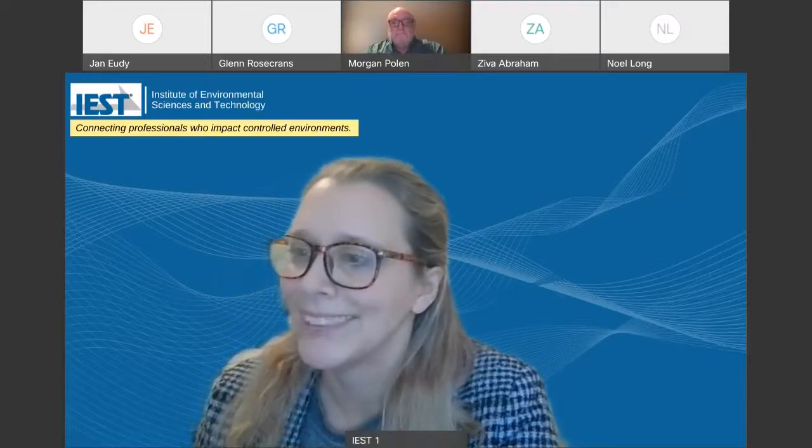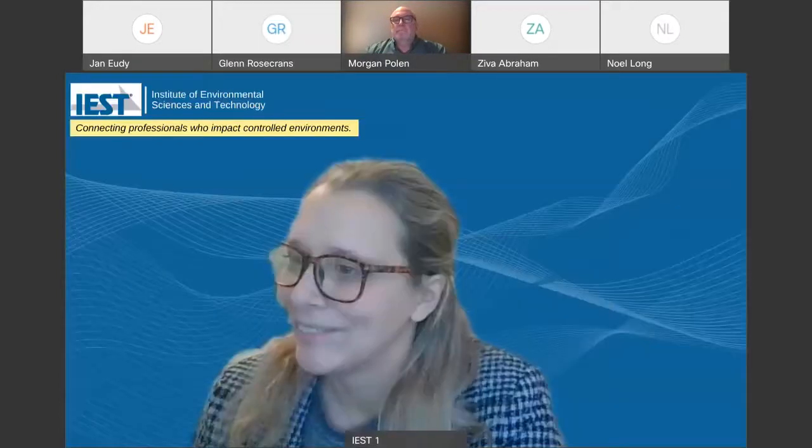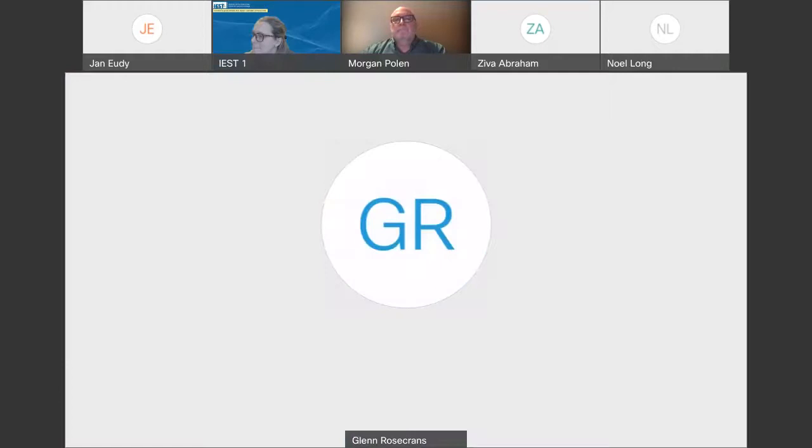Well, I've been in contamination for 20 some odd years and working at Goddard. Some of our folks in our planetary protection group are concerned about the topic today. I'm not sure if any of them are dialed in, but I always had this question anyways from being in the clean room and certainly with using alcohol to wipe off surfaces, that tends to do a pretty good number, but there's other places I haven't seen, and certainly the ductwork and such like that, that things can grow and fester.